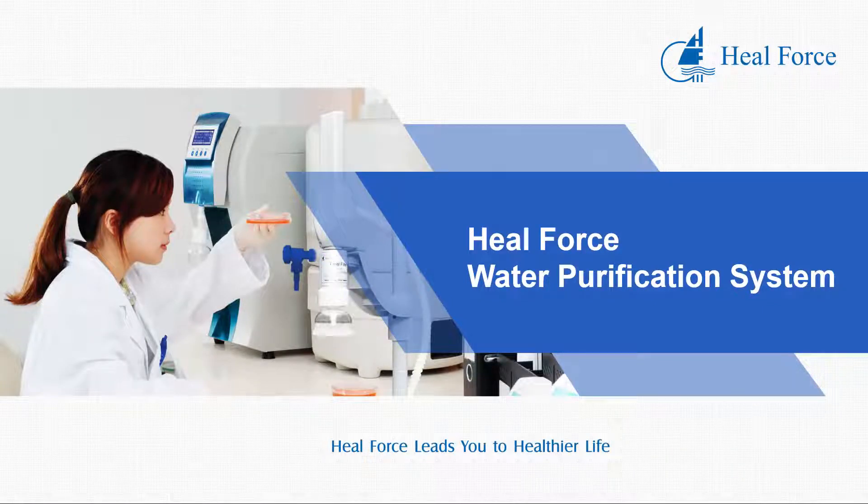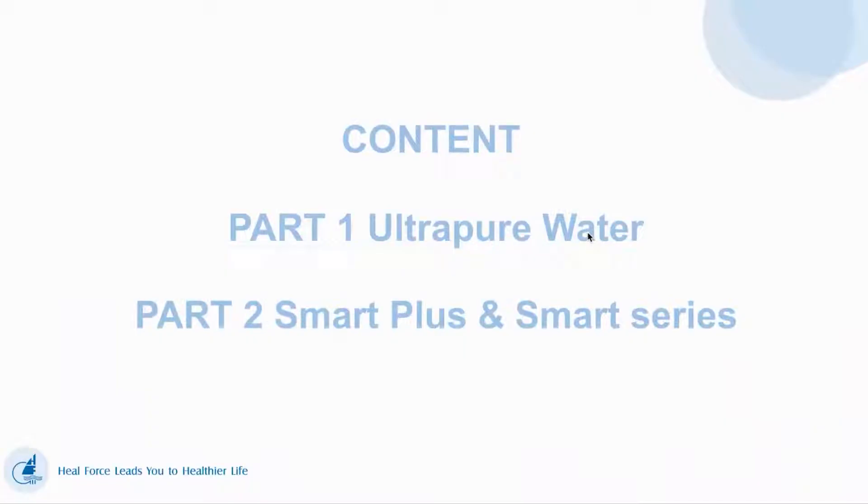Hello, welcome to Heal Force channel. I'm Hank. Today I will introduce the water purification system. First, we will introduce ultra-pure water. Then we will introduce our Smart Plus and Smart Series.